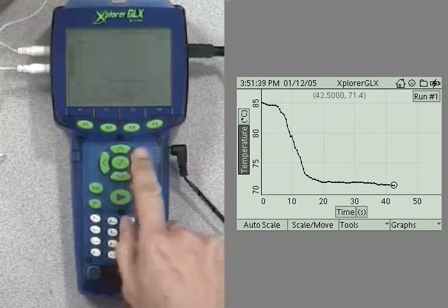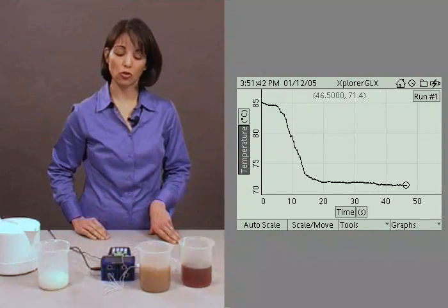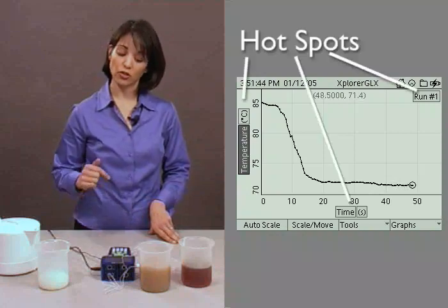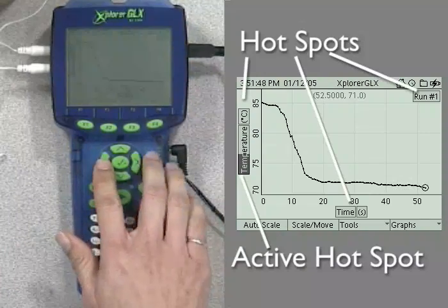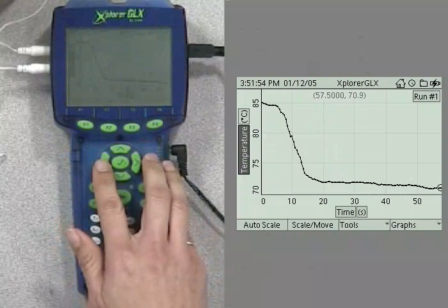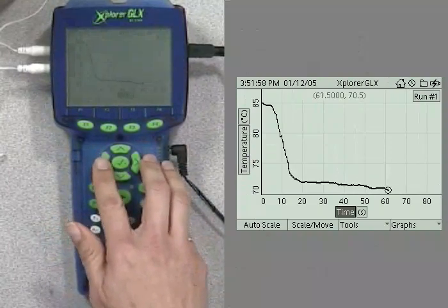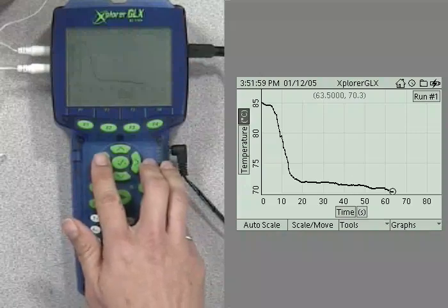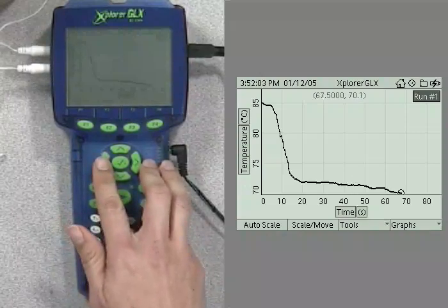Push that. And you see now that a number of items on the screen become highlighted. These are called hot spots. The shaded one is the active hot spot. And I can move through those hot spots with the arrow key. You see that they include my y-axis temperature, or my y-axis measurement, my x-axis measurement, my y and x-axis unit, and the run number.